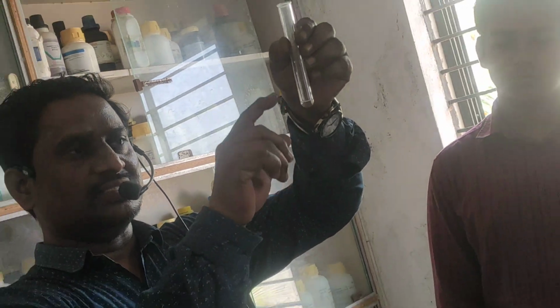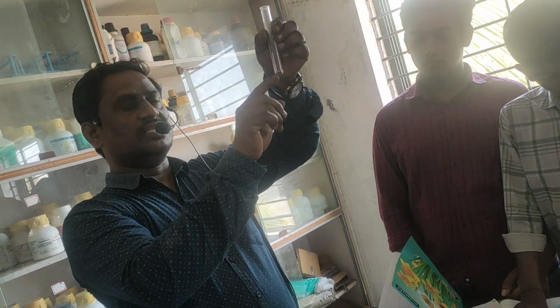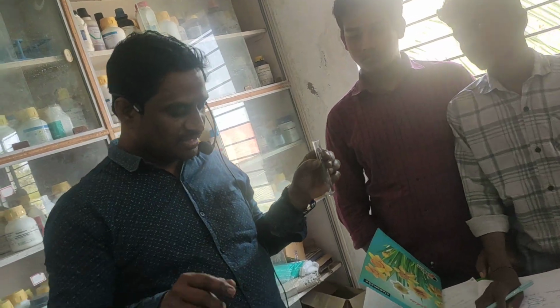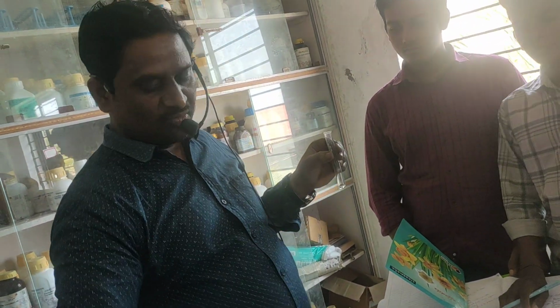What is the group 1 test? Tell all of you. Look in your materials: for the original solution, what do you have to add for group 1? Dilute HCl. What should you get? If you get a precipitate, it means group 1 is present.